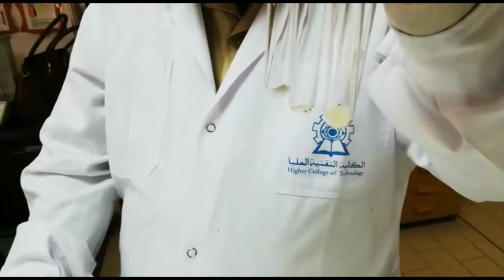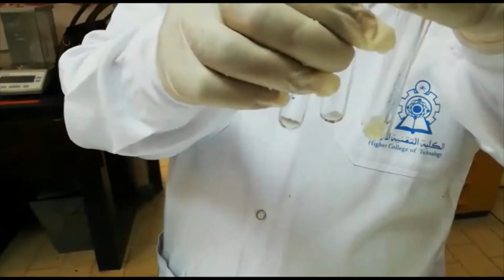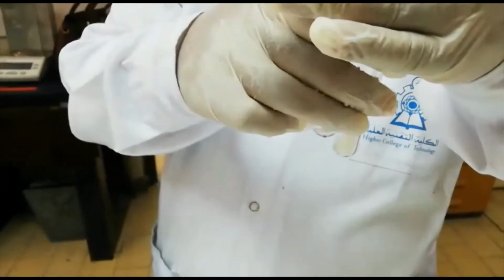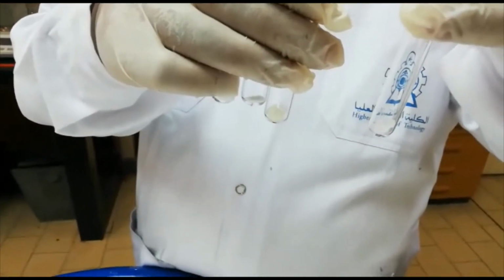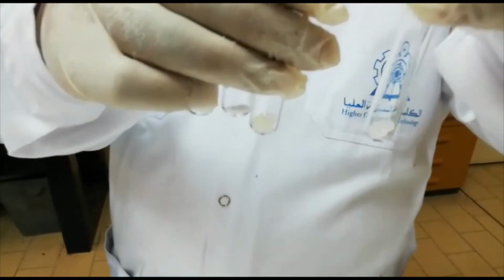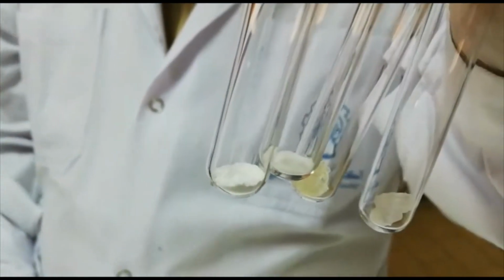So we have these group 1 salts. The first one is carbonate, second one is sulfite, third one is NO2. We are not doing sulfide S2 because it's producing H2S, which has a very bad smell. And the fourth one is S2O3, thiosulfate. So now the group reagent for this group is HCl. We are adding HCl in every one.